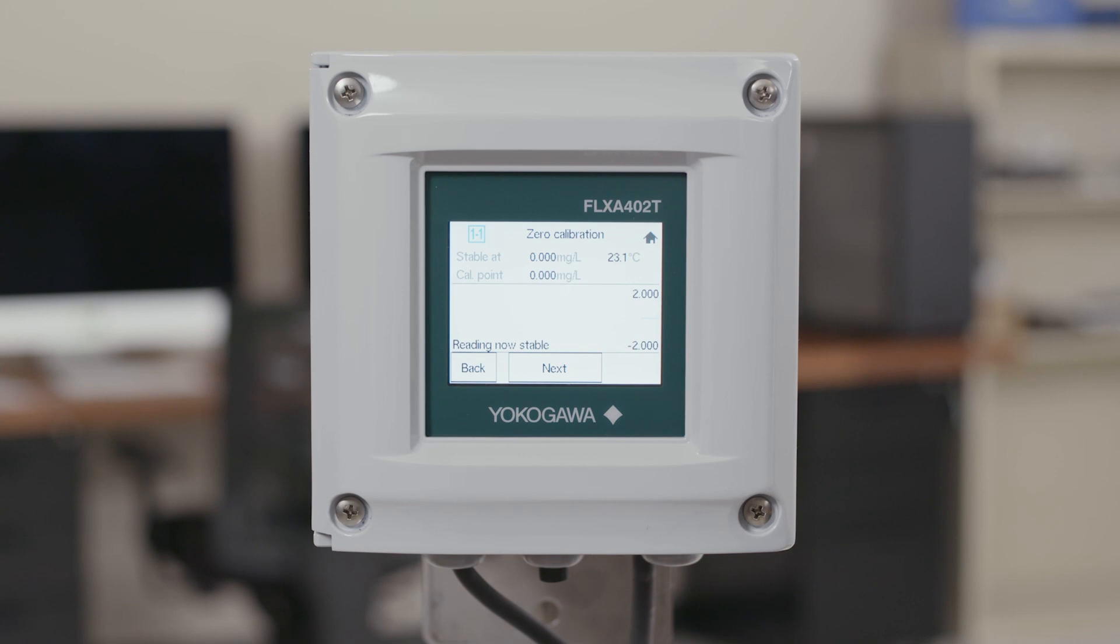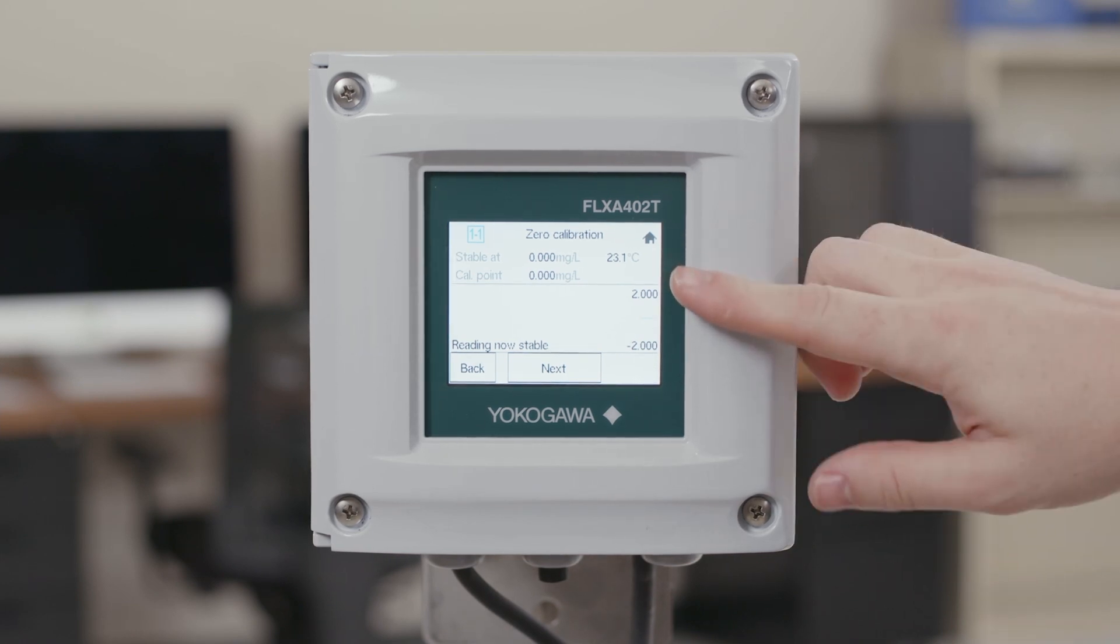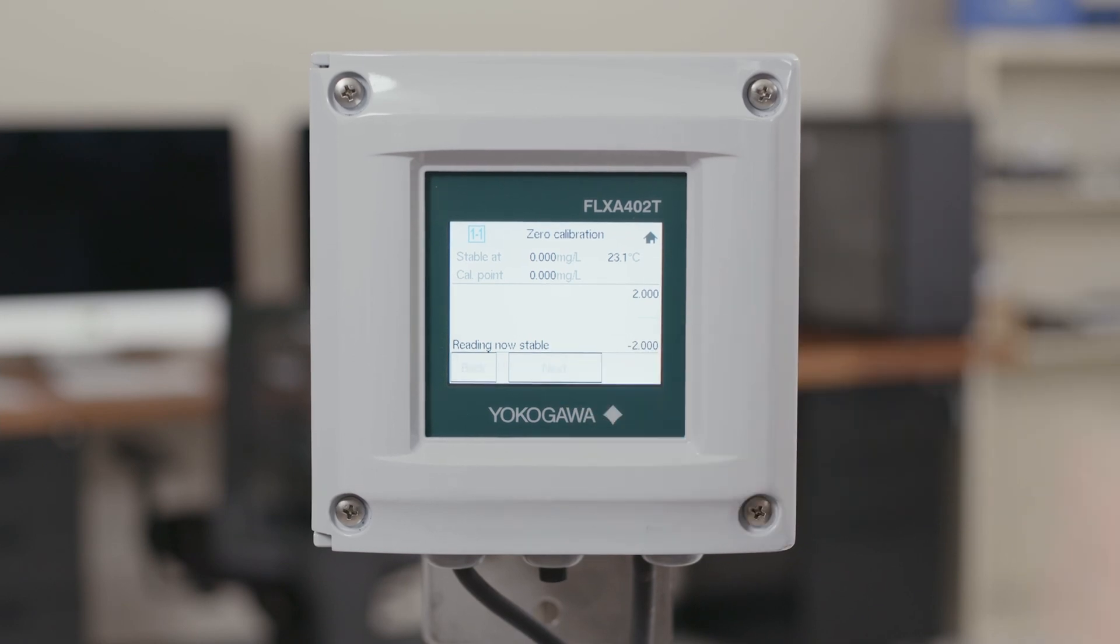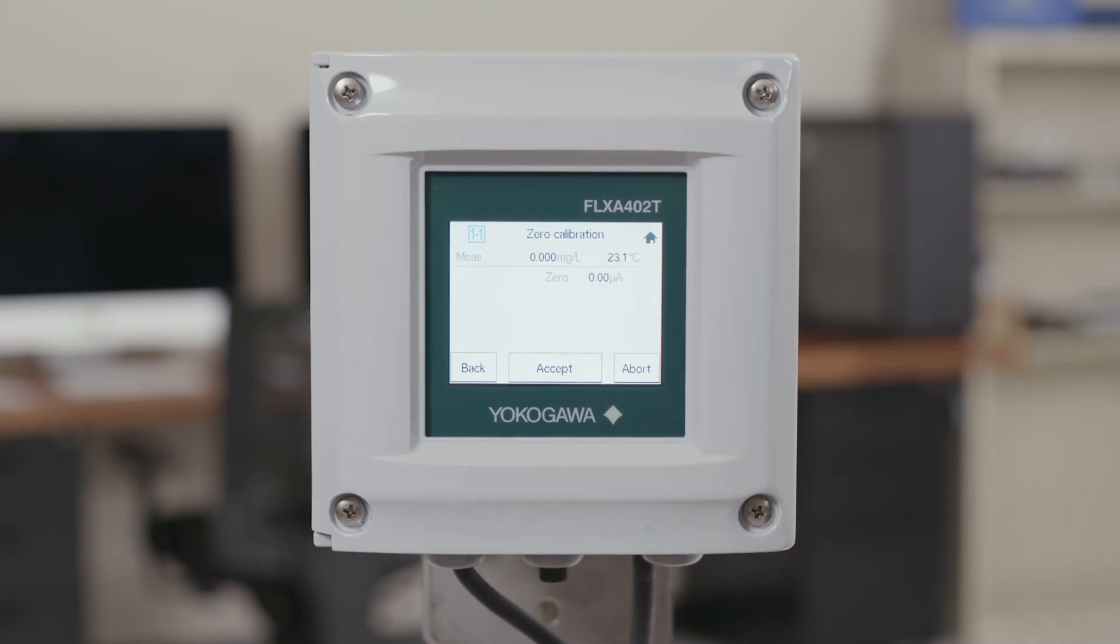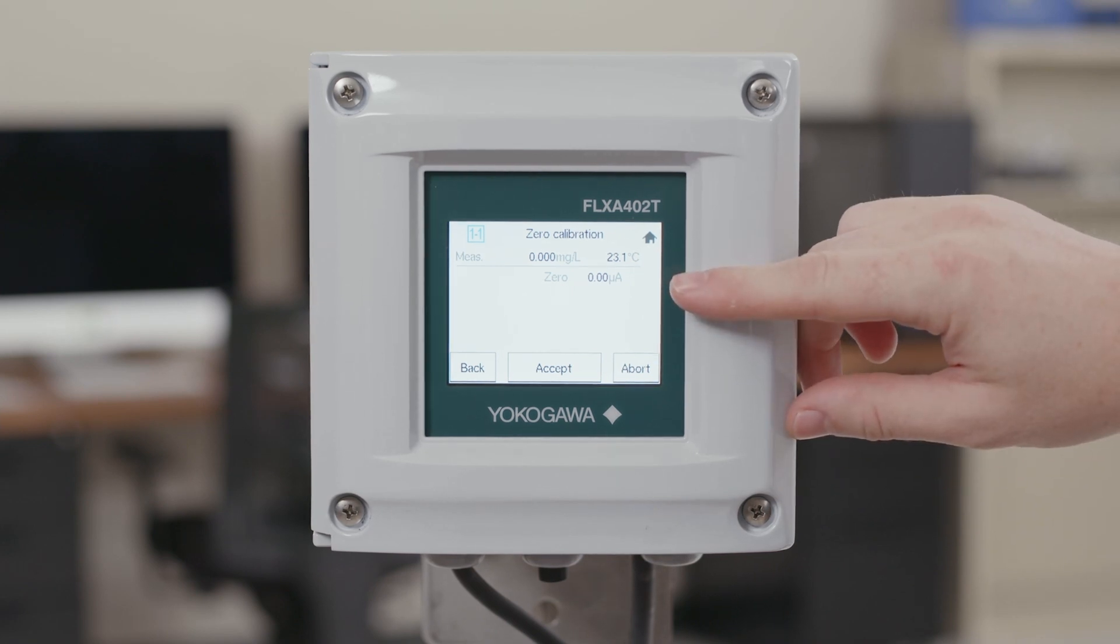This will set the calibration so you can see what your stable reading was, what your cal point is, which for the zero calibration should be zero. By clicking the next button it will take you to another screen that will show you what your zero point is and what your current measurement is.